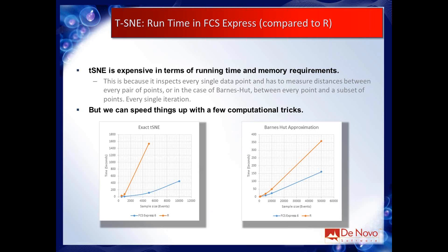So it's worth using that subsampling and then just mapping the unsampled points later on. A lot of times you're going to get really similar results as long as all your populations can be sufficiently represented by the number of samples. It's going to be okay.